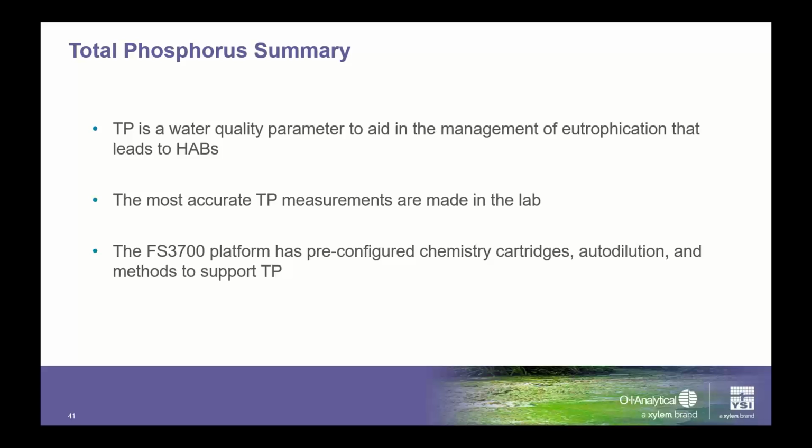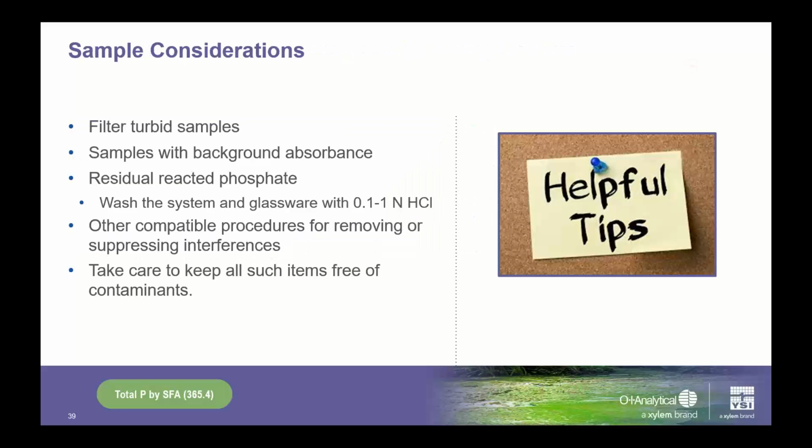Someone asked about the wavelength for the phosphorus complex. I have to apologize. I think it's 660 nanometers, because it is that molybdenum blue. But if you go to the green buttons on those methods that I was talking about earlier, it will have that wavelength for you. I'm pretty sure it's 660, but double check that by going to the hyperlink for this method.